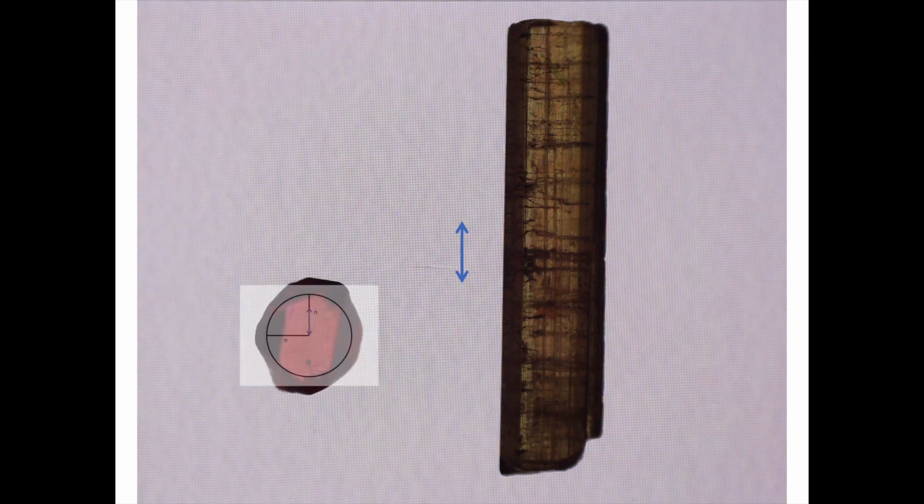And so what effectively happens as we rotate our spinel in plane polarized light is that plane polarized light is always interacting with refractive index n, and well, nothing really interesting happens. We don't have any pleochroism. And when we go over to viewing our spinel with crossed polarizers, the spinel effectively stays at extinction no matter the rotation because there's no reorientation of the light. Once again, because the light is only ever interacting with one refractive index n.